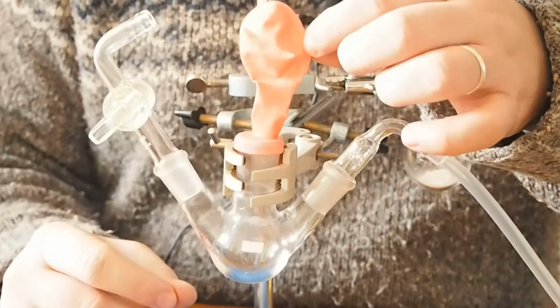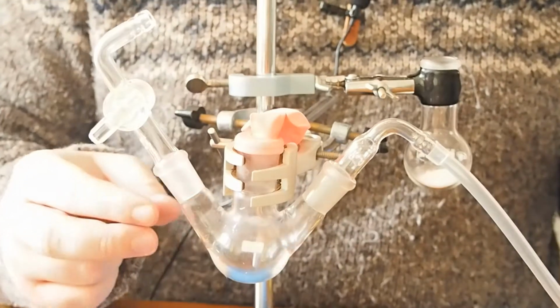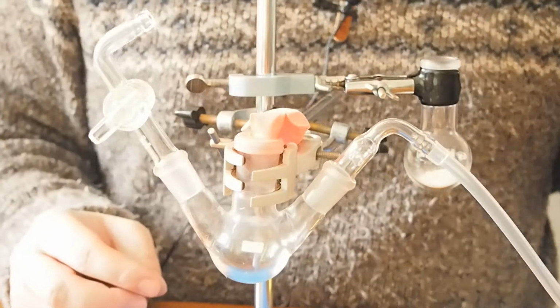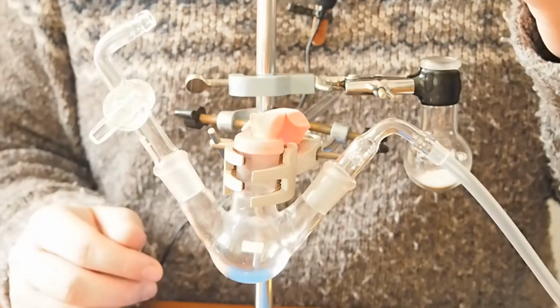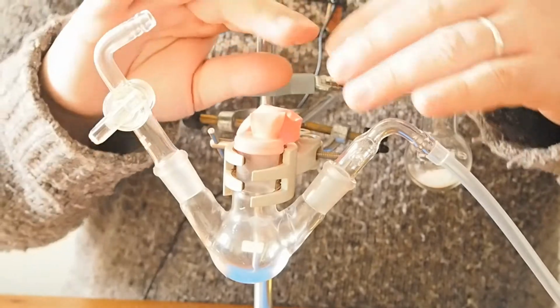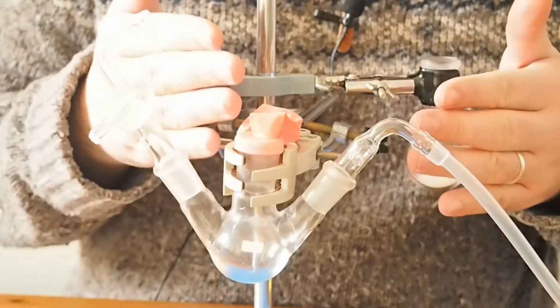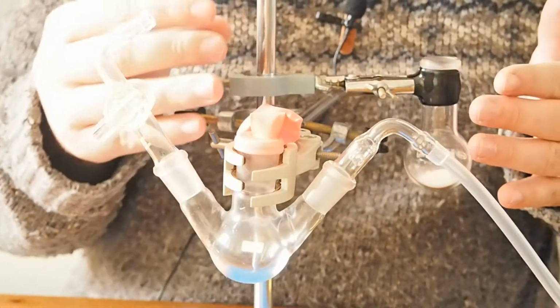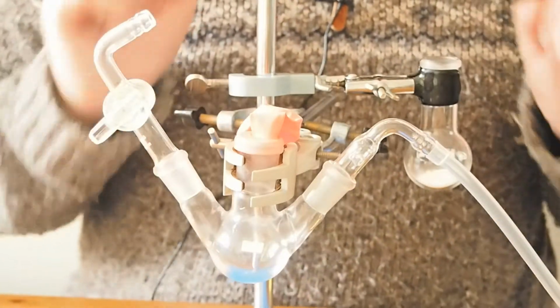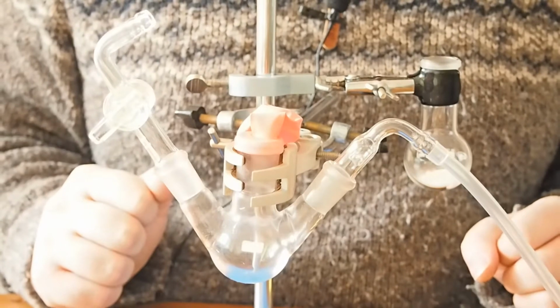Now that acts a little bit like a reservoir, because if I ever need to cut this system off from the carbon dioxide supply, I don't want air to just rush in. So if we have a balloon of carbon dioxide, it'll put a positive pressure. That means some of that carbon dioxide will rush out, and it will keep whatever's in here under a carbon dioxide atmosphere.